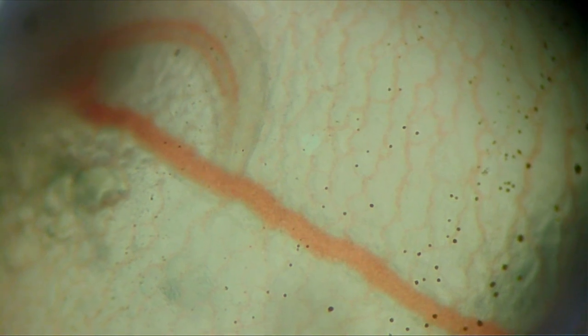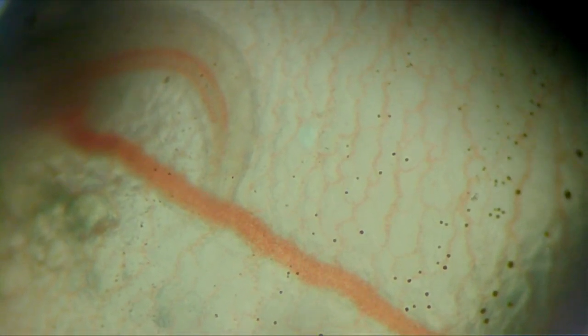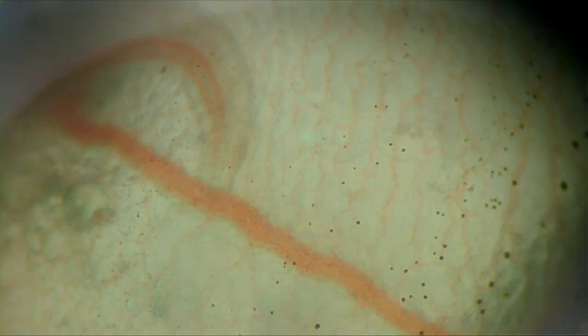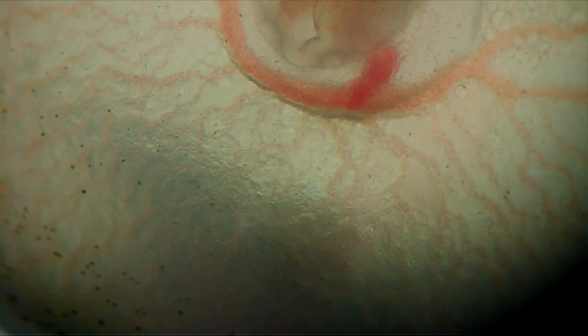As we get in closer, you can see each individual blood vessel. The blood continues around the egg to the backside, splits, and then brings oxygen to the egg yolk. This is going to be food which supplies energy for the fish to develop. It comes back around and splits again into small branching veins, which then coalesce back to the beginning.